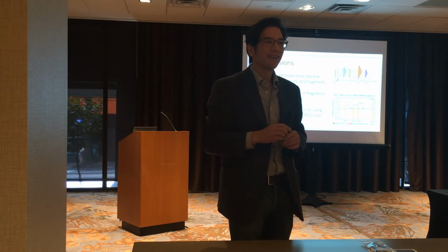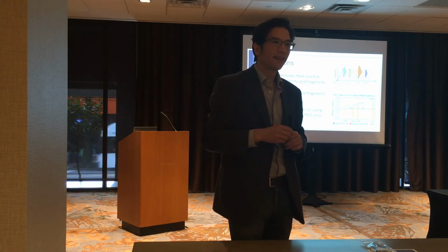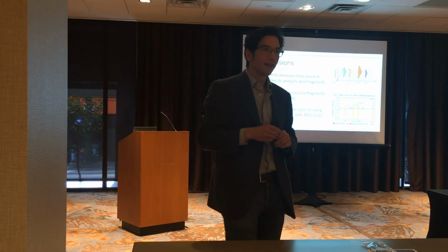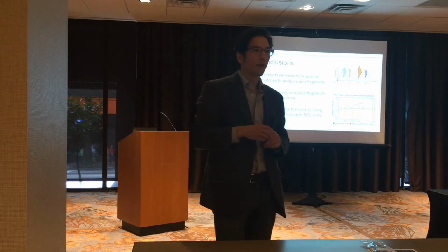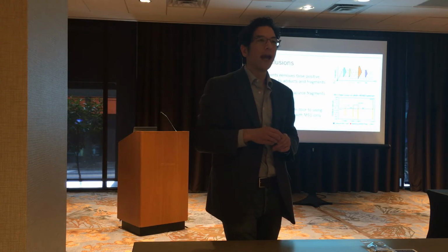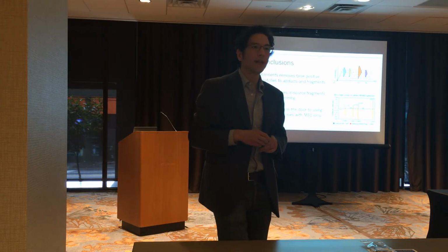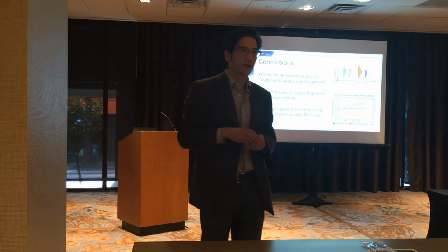Tony? Have you tried to change some of the voltages in the source to actually increase your in-source fragmentation? Yeah, potentially if you were running something that was like an Exactive only, and you had no chance other than looking at in-source fragments, I think it would make sense to increase the voltage on the source.